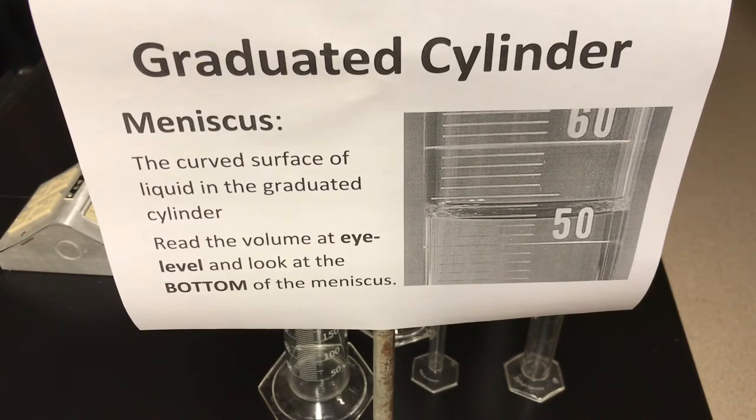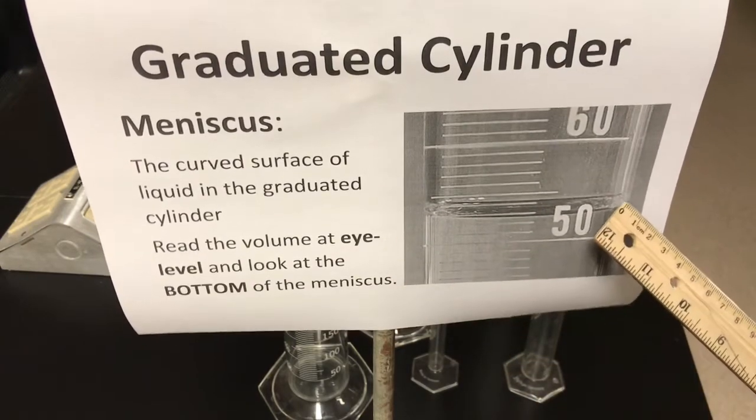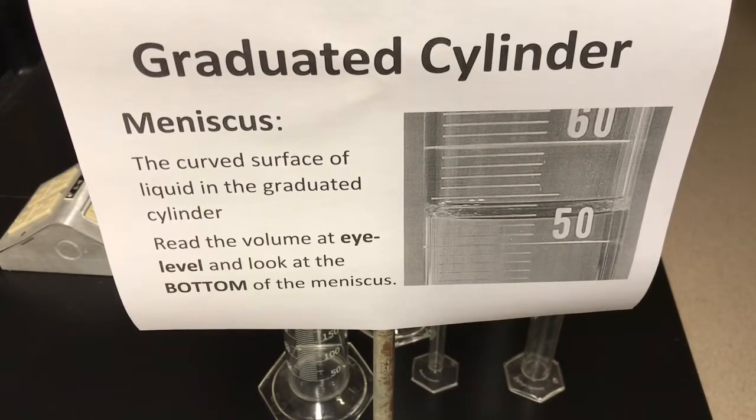The second thing to remember is when looking at the volume of liquid in the cylinder, always look at the bottom of the meniscus. So when you look at that curved surface, you would not look over here on the edge — you'd look at the very bottom-most point of that curved surface. That's the bottom of the meniscus where you want to look to record the volume.